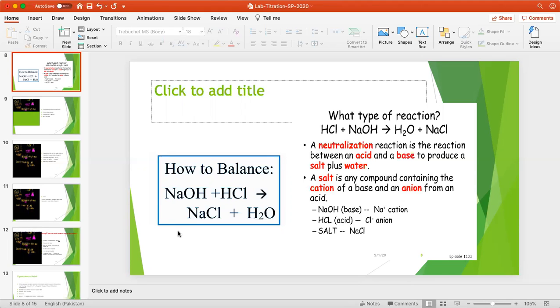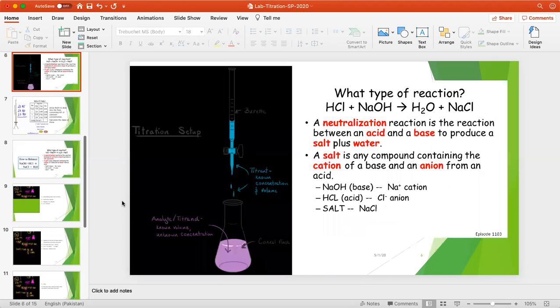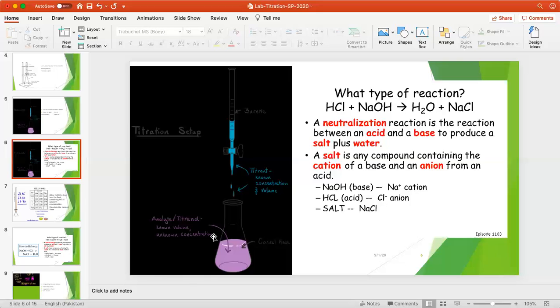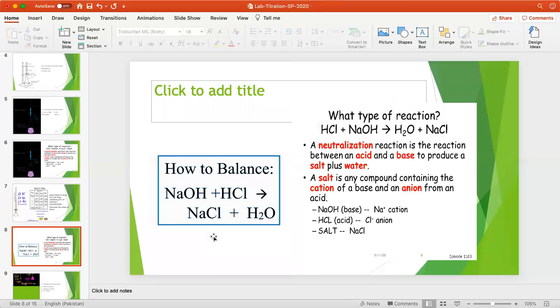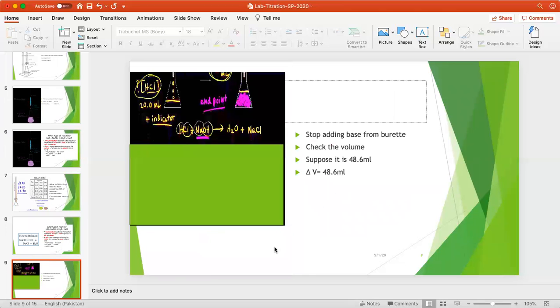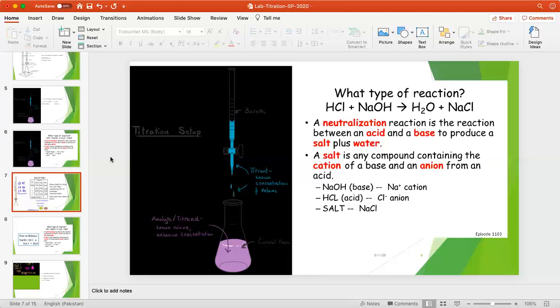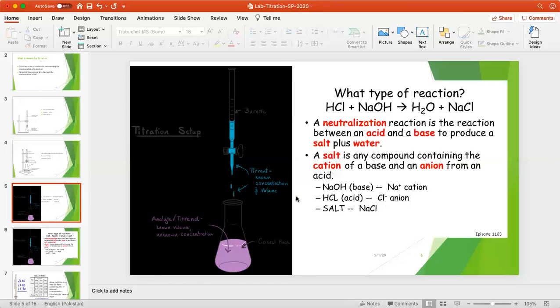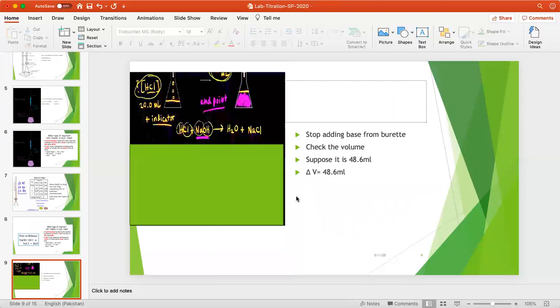The original concentration, which is molarity, is equal to moles over liters. Now I know how many moles of HCl I had in my original volume of HCl. Original volume क्या था? Let me show you. यहाँ पे जब आपने ऐड किया था और मैंने आपको बताया था कि जो ओरिजिनल वॉल्यूम हम ले रहे हैं इसका एसिड का, दैट इज 20, ठीक है। 20 हमने ओरिजिनल लिया था। Let me see where is that slide. This is the slide. ओरिजिनल वॉल्यूम हमने लिया था 20 ml का, राइट। Now move to the slides where we were talking about this.